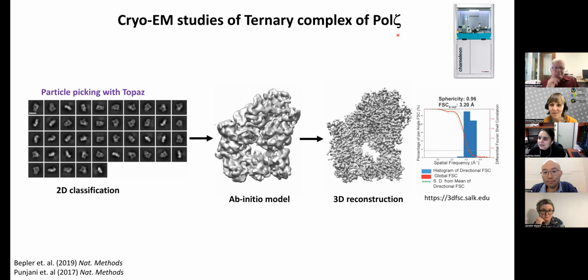But for DNA-protein complexes, detergent is something which has not worked for us for some reason. We have also tried detergents for our complexes. There are a lot of ways of solving it, and basically you try everything. But Chameleon, if it works, is very brilliant. It's just a one-shot thing, and you get a beautiful structure.